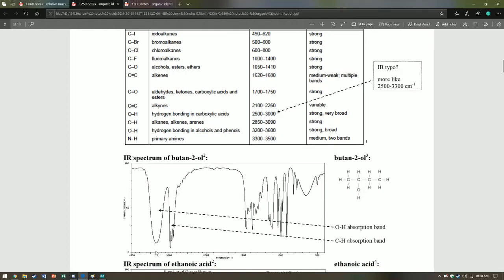So here we have a dip, which looks to be about 3350, and then here we have a peak at 3000, and so on. And then from 1500 down, we have what we call the fingerprint region, which basically, if you have an idea as to what the compound is, it's like a fingerprint. You can look it up in a book. I'm sure there's a big book of all the known compounds, and if the fingerprint matches, then congratulations, you have the compound.